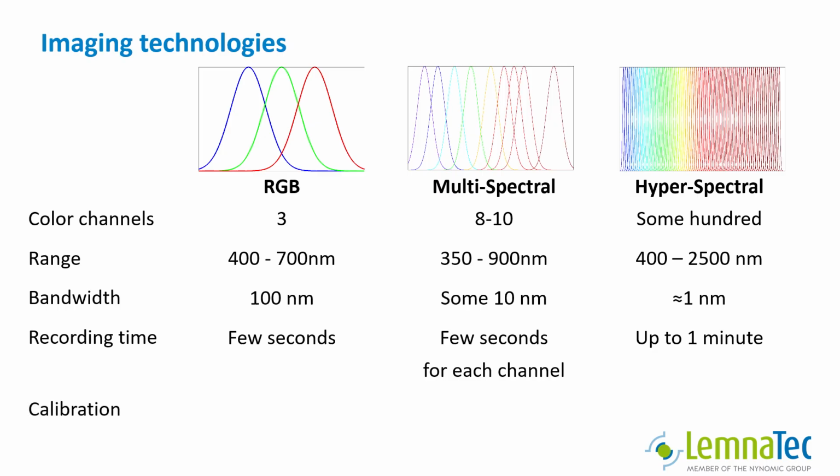In order to record RGB images correctly, we need to adjust their white balance. This is usually done by LemnaTec, but you can readjust it to your needs. Before hyperspectral scans, a special white target is recorded. We measure here the maximum value we can expect from each channel and at each position of the scan line, so we can correct for it in the analysis.